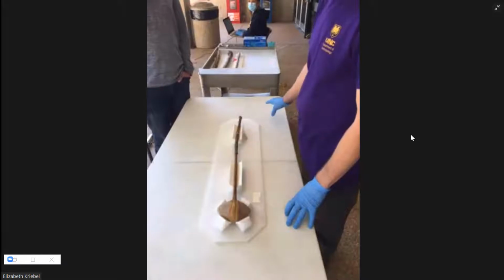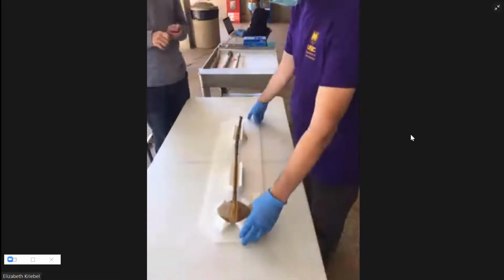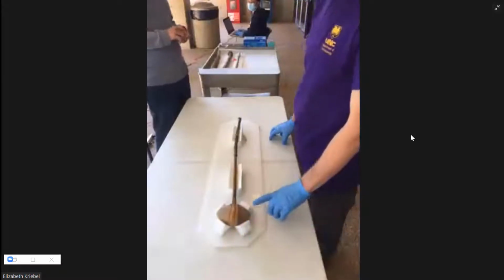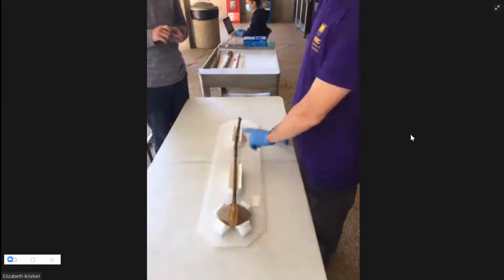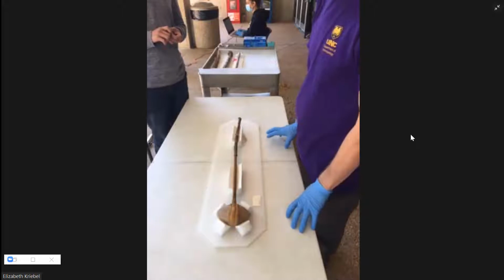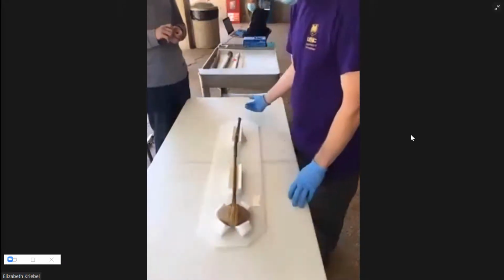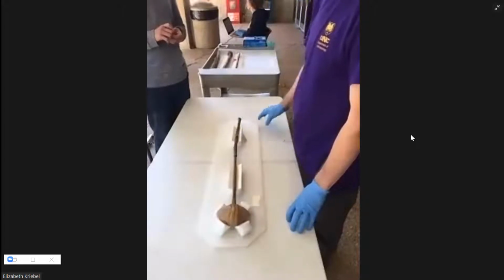I don't see any coloring or pigments, but as we just discovered, maybe we used to have some and they're no longer with us. We have a quartz stone here, and the rest appears to be rawhide or some version thereof. Presumably inside of this is a branch or other flexible handle that's been wrapped for reinforcement.